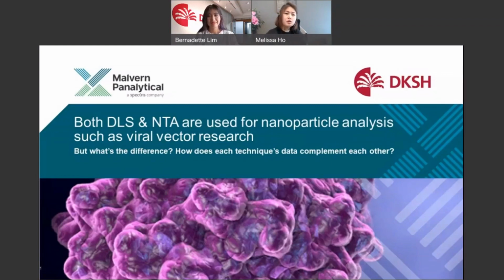So if you have been joining our webinar series, we've been doing a lot since pre-COVID days, and we want to do a quick recap of our previous webinar, which was really interesting, and many people had a lot of questions from it. So basically, as you can see on the screen, different techniques such as dynamic light scattering, DLS, and nano tracking analysis, NTA, are both used for nano research.